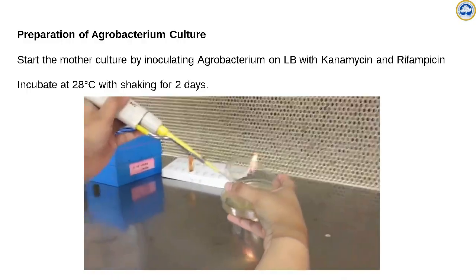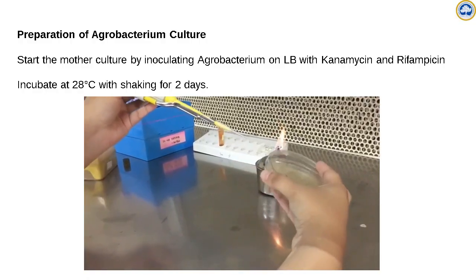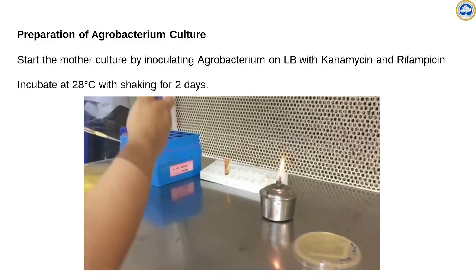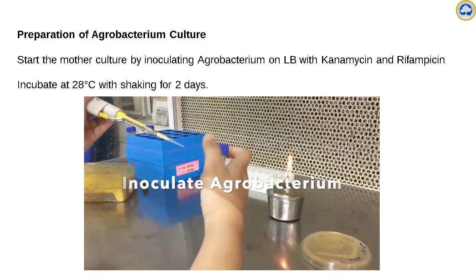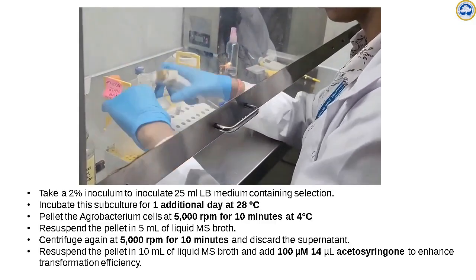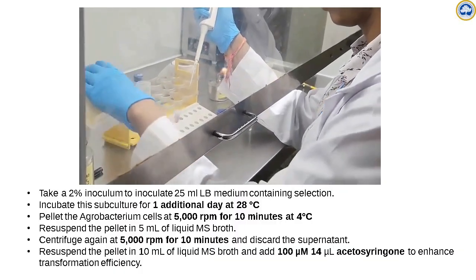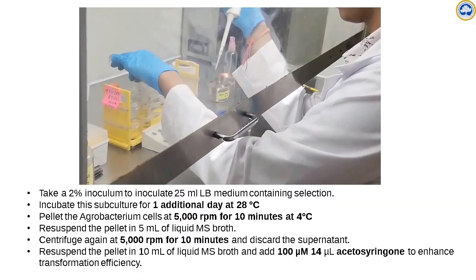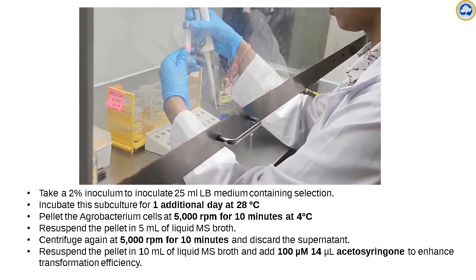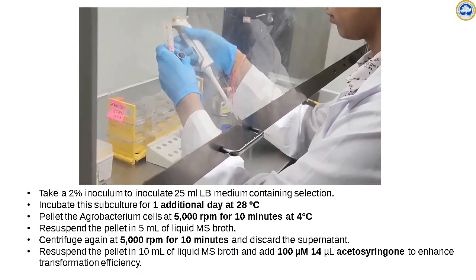So accordingly, rif and kan were added and a single colony from the agrobacterium plate is inoculated into the 5 ml broth. And this is cultured at 28 degrees Celsius, shaking for 2 days. Once the mother culture is ready, we prepare the working culture from the mother culture, where we inoculate 1% or 2% of the inoculum into LB broth. The volume can be 25 or 50 ml as required for your experiment.